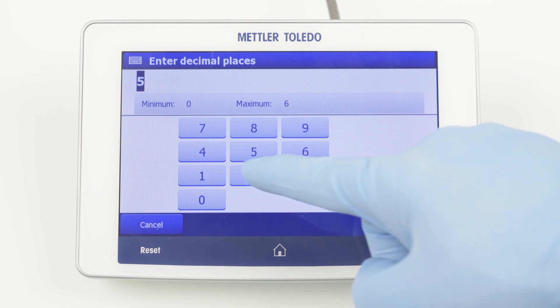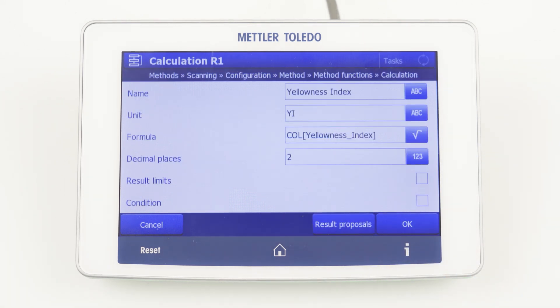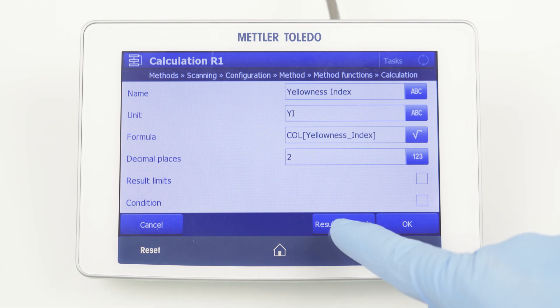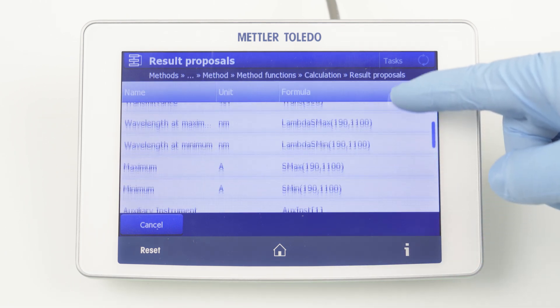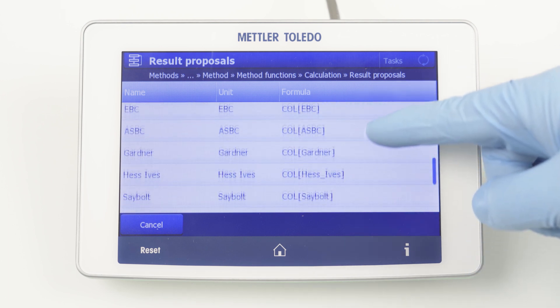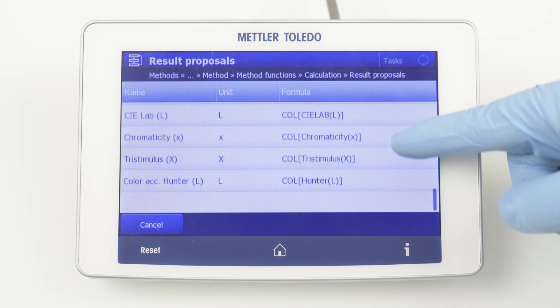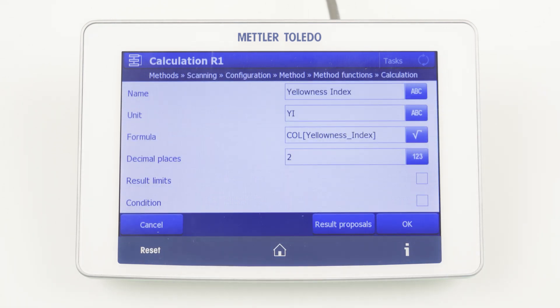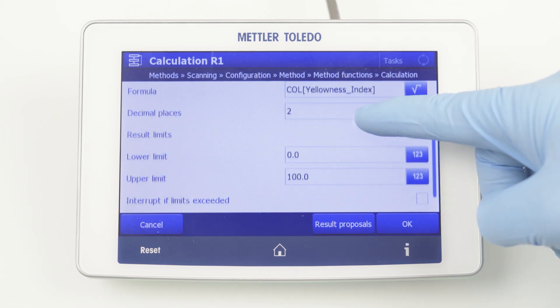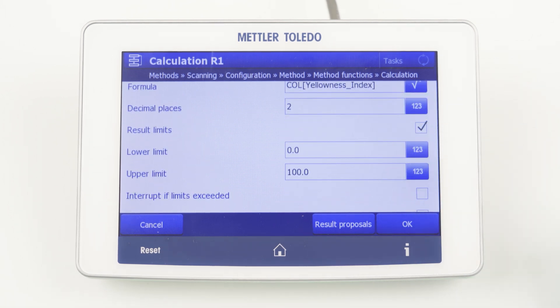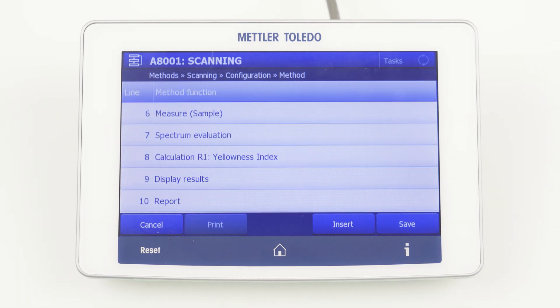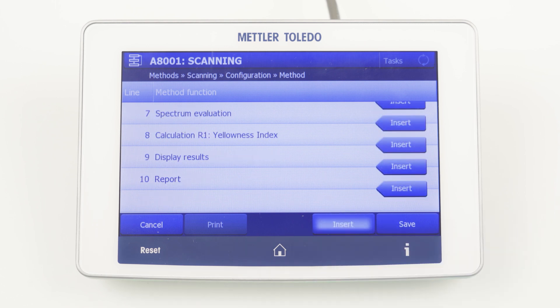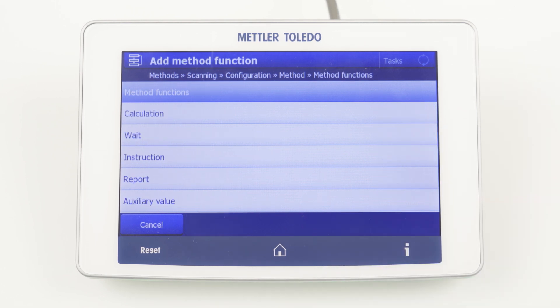Additionally, you can define the number of decimals, for example 2. Some color calculations are also predefined under result proposals; in this case the method function is automatically filled. The operator can define an upper and lower limit for the result for quality control. It is important to mention that you can add as many calculations as you want. So, with only one method, you can determine several color scales or get other information, like absorbance at a specific wavelength. You simply insert another calculation method function for this purpose.